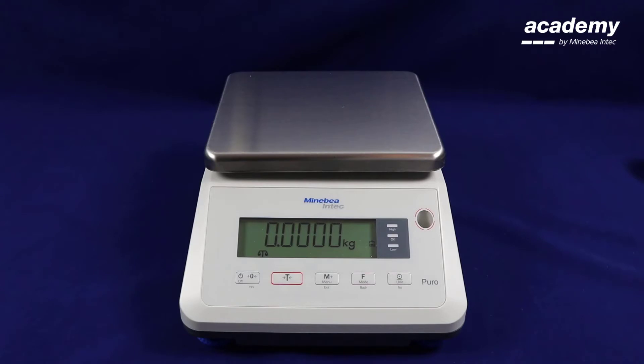Hello and welcome to Puro. In this video we will demonstrate how to use the totalizing application. The purpose of this application is to add up different weight samples and give you the total weight.